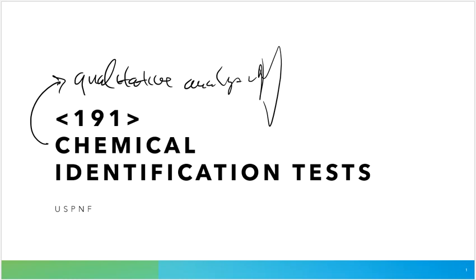Chemical identification, or chemical ID test, is really just a formal way to talk about qualitative analysis. And qualitative analysis, back in the day when we talked about it in the 114 course, was just observational based. That's all that they are. So these are observational based tests that we're going to add a few things to most of the time, and then we're going to write down what we see.